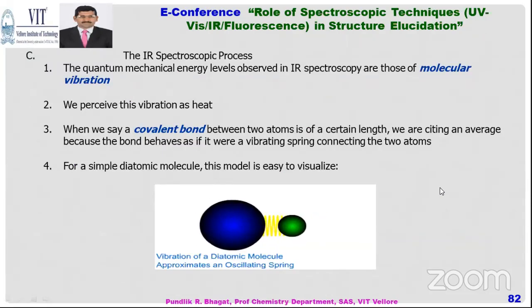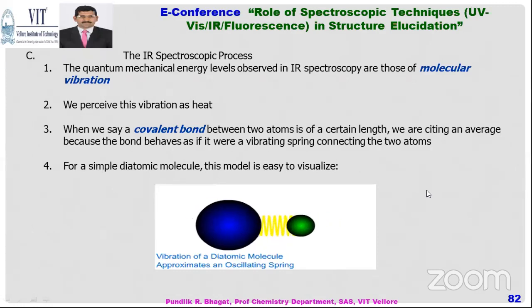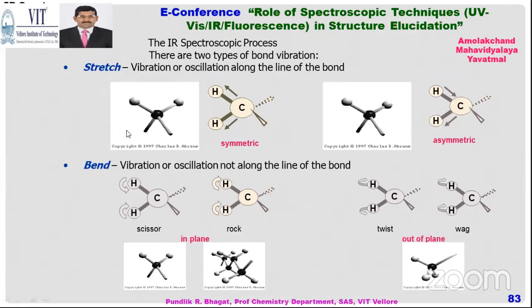So there is another example of how vibration of the molecule is taking place when higher radiations are absorbed by the molecule. And after absorption, there are different stretching oscillations, or bending. So either bonds will stretch or they will bend. There are two types of stretching, symmetric stretching, which is shown here. At the same time, both the bonds are moving away and again coming closer. So here it is asymmetric stretching. Asymmetric stretching will have more absorption compared to symmetric stretching.